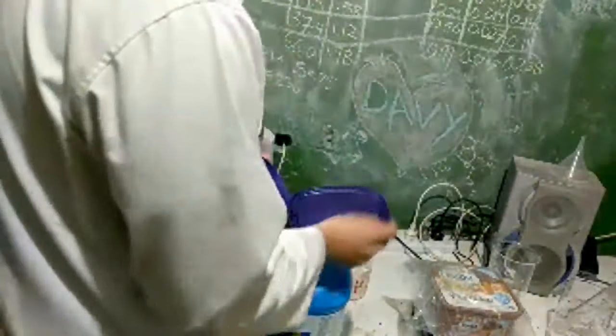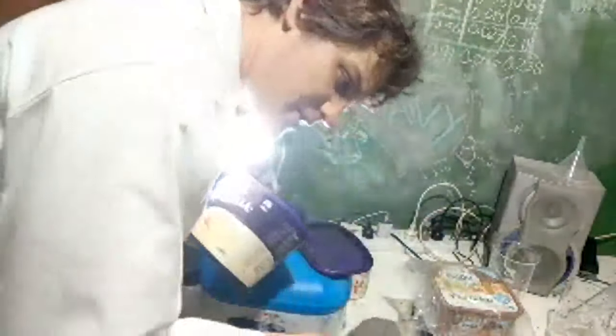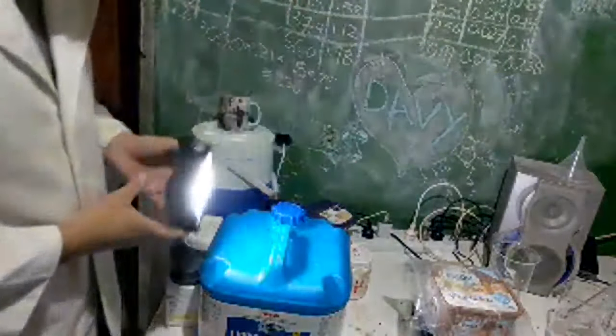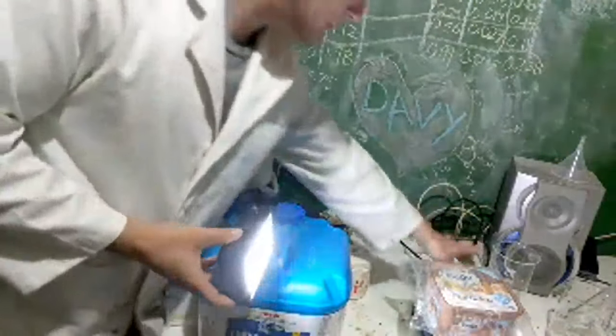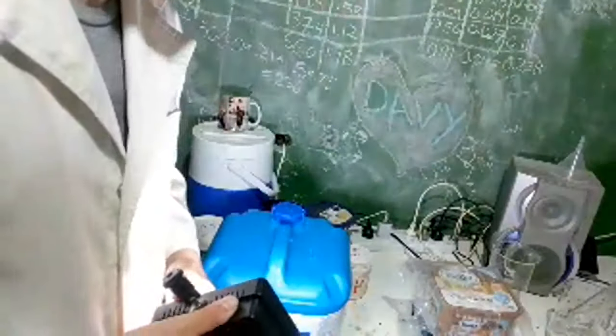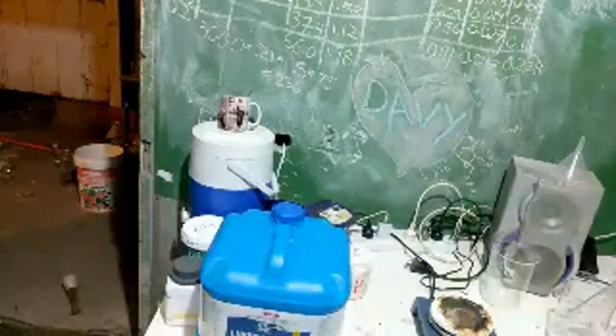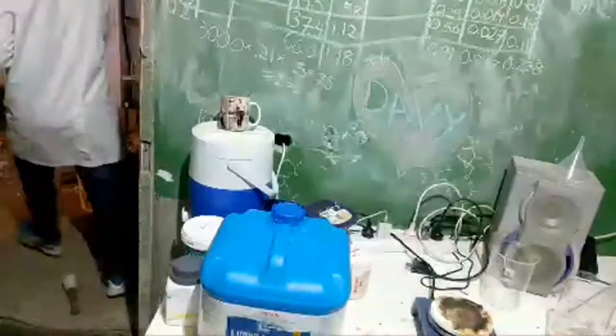All right, oh, so you also have steel wool here. It's here, but there's only 8 grams, so should be all right. We'll try and get as much out as we can with that. So, have we worked out what we're doing yet? Got all the chemicals. Has anyone worked out how I should mix them or something like that? Could put some gloves on. Starting point. I'll put this over here.